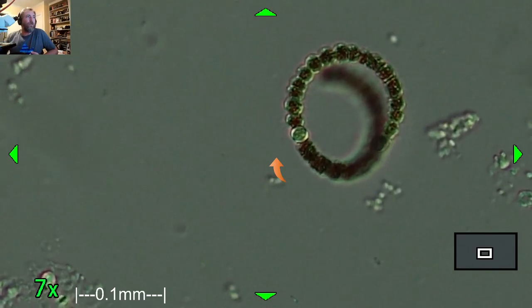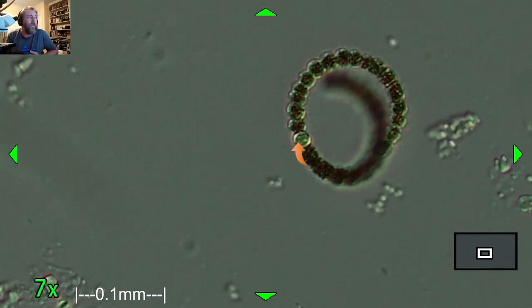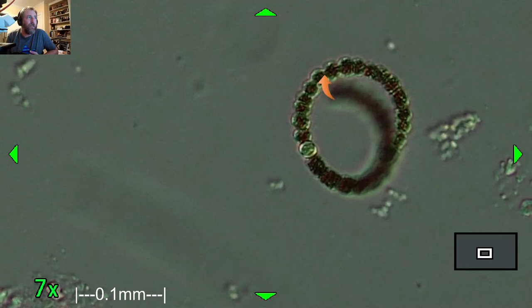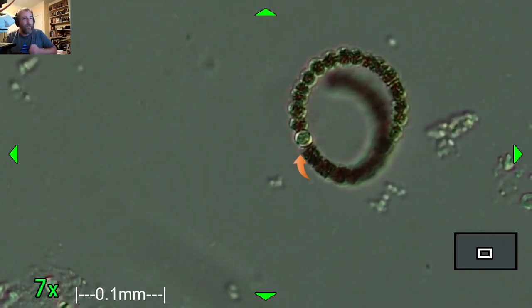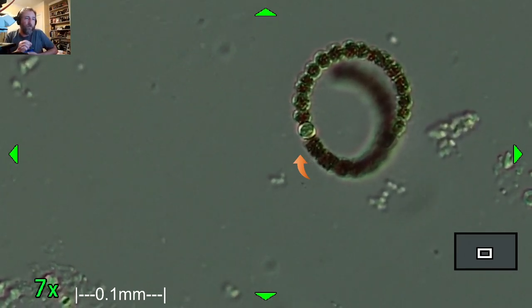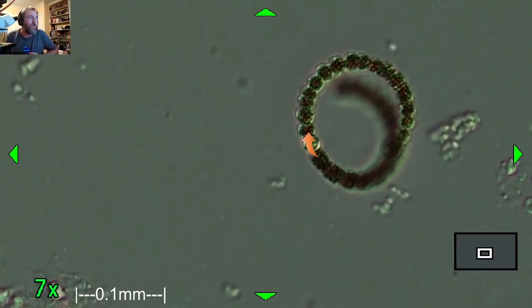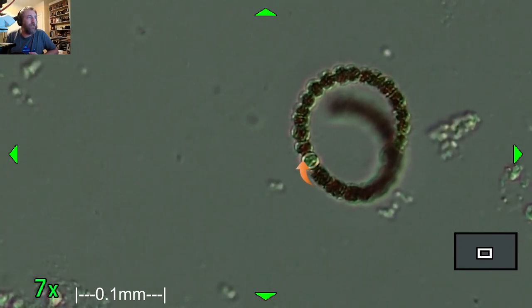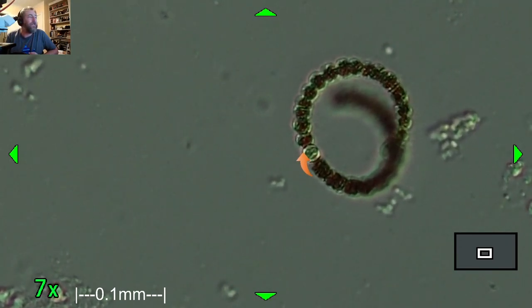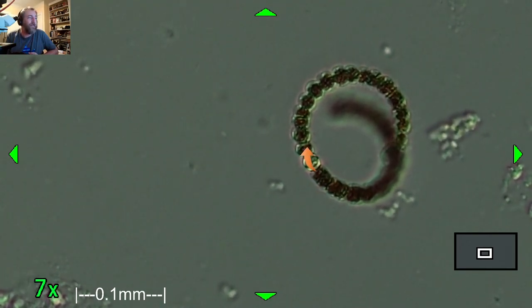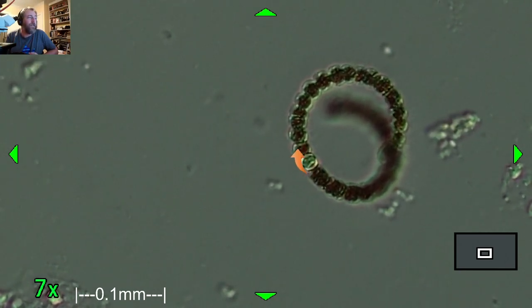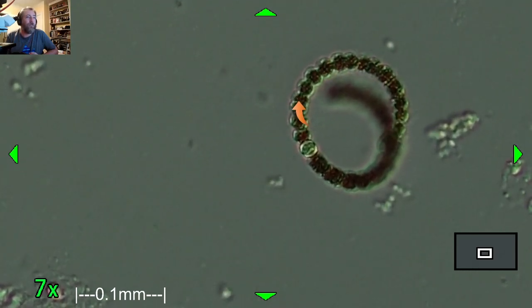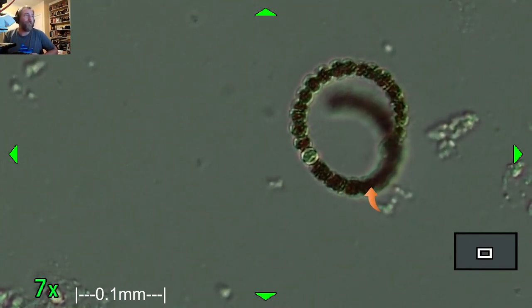And what's cool about Anabena and many of the cyanobacteria that live in lake systems, it has these cells that are here. Sort of normal cells. They look like little beads. And then there's this one which looks a little bit different than the rest of them. And if we zoom in, you'll see the cell actually looks different. And in algae, when we have a cell that looks different than the rest of the cells, we refer to that as a heterocyst.